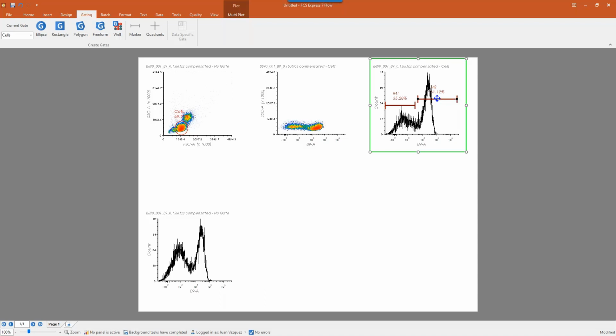Okay. And what I like to do is with my markers, I actually like to link them in the middle. So that way I just have a single vertex to control between the two. And the way I can link them is simply just by taking one end and just dragging it over the other. And you'll see how my cursor will change to a plus sign, where if I let go, now I can actually control the high point and low point of those two markers together.